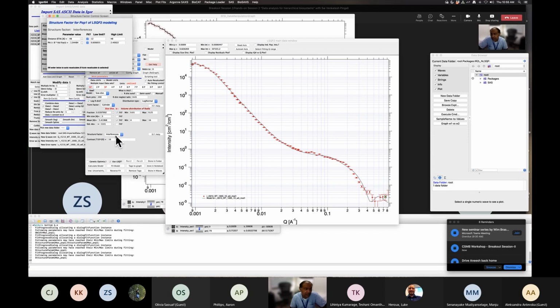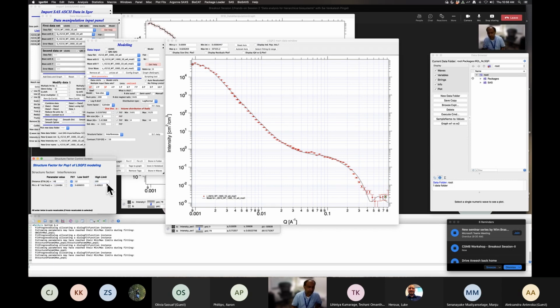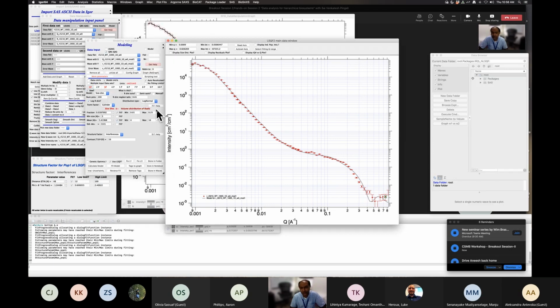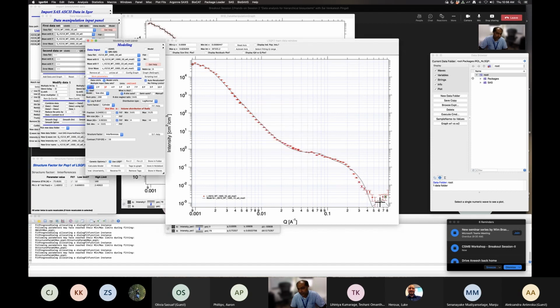But there is something that's happened. The interference seems like it wants to move that up here, and it's hit a limit. So play with that to see why it wants to do that. So maybe there's a feature that's not able to pick. So this is what's happening here. It's trying to fit for this peak here. It's trying to move this peak to fit this part, and so then it's corrupting everything around that.